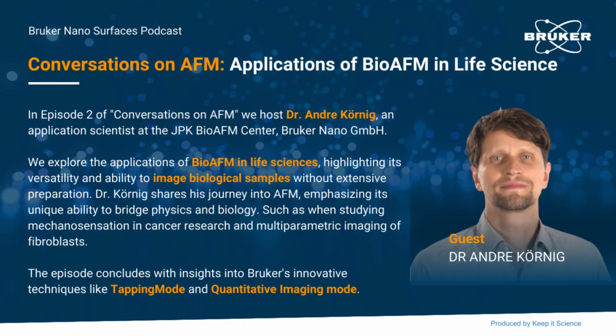And you have obviously been working for a long time, so you have seen the trends about 10 years ago and the later ones as well. So have you maybe seen some change in the type of samples that people are looking at, or what are the newer applications that people are using AFM or BioAFM for?